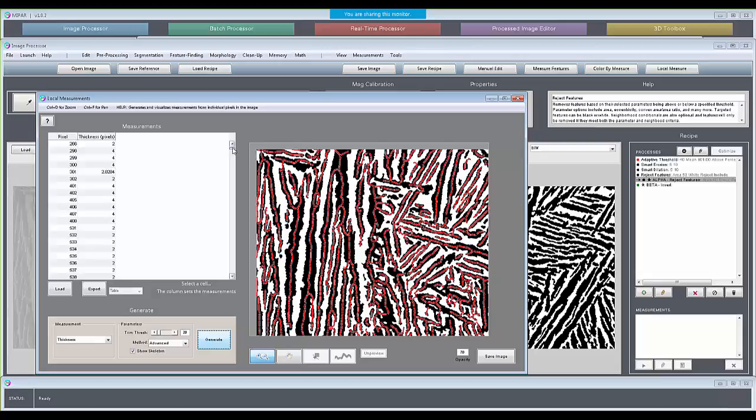So this is just the pixel ID number. It's not very important, but these are all the pixels that fall on the skeleton. We've got a thickness value for each. So you can export the table. Once we've visualized it, you can also export average values per feature, min values, max values, standard deviations, other things.